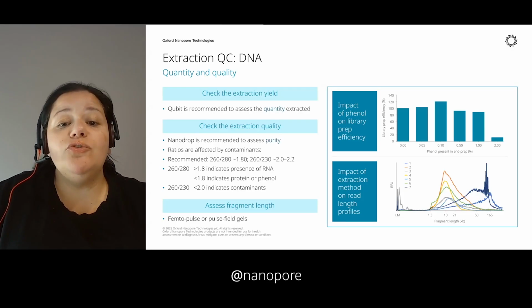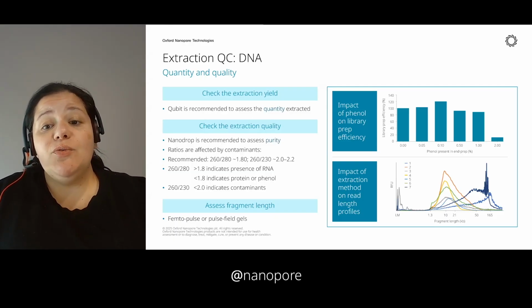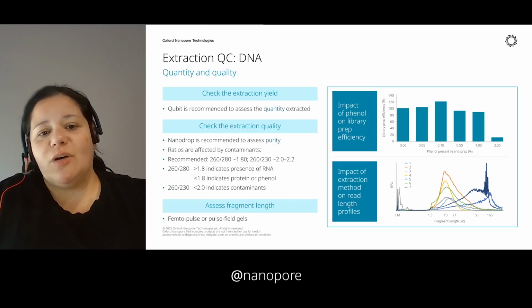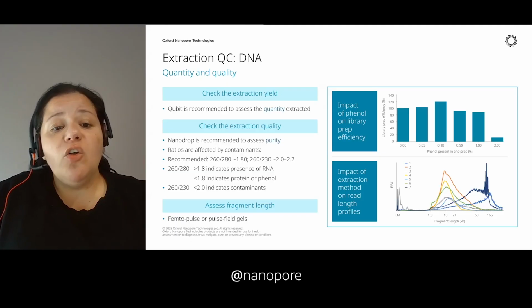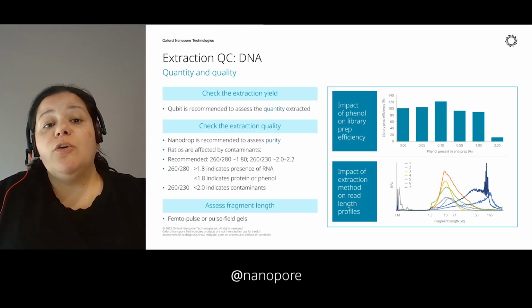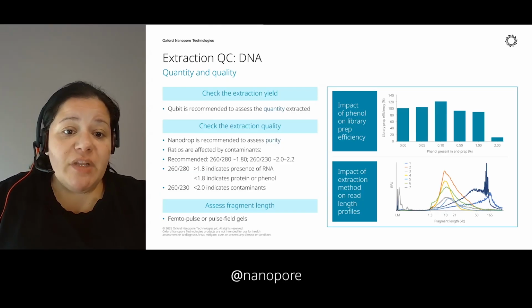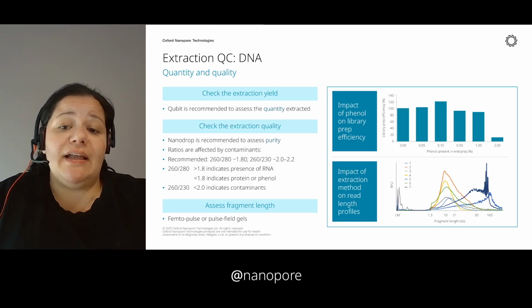So if you want to use a ligation-based library preparation approach, you would probably have to fragment those samples, 1 and 7, to make sure it is efficient. All of the other samples could be sequenced as they are, but if you wanted to deplete short fragments, then you could use size selection. So it's important to see how your sample looks so that you can make an informed decision on how to manipulate the sample to make sure you get the most out of it.